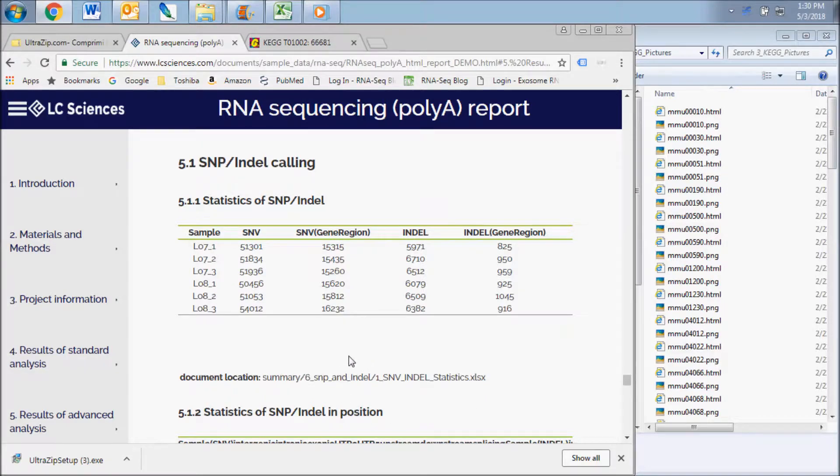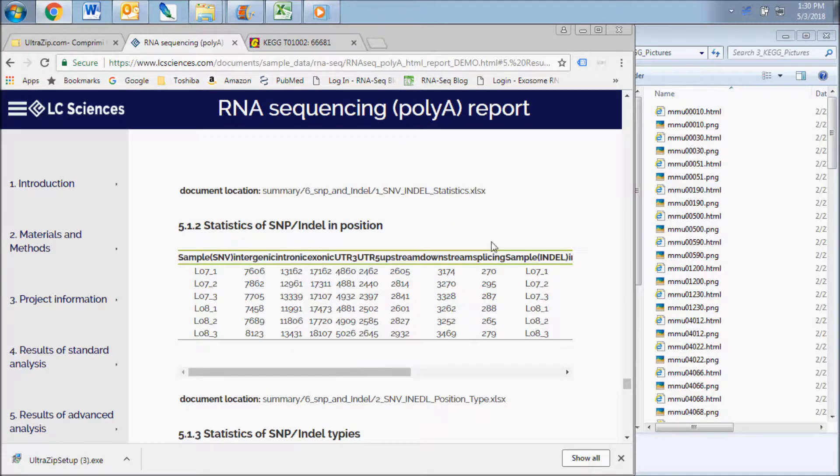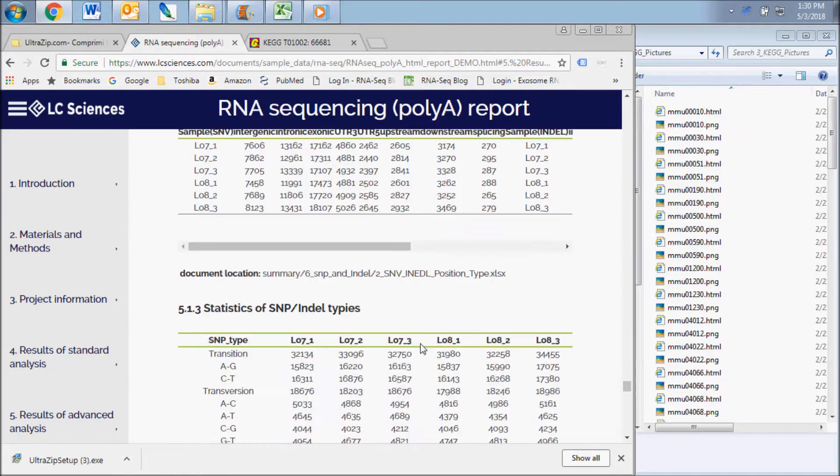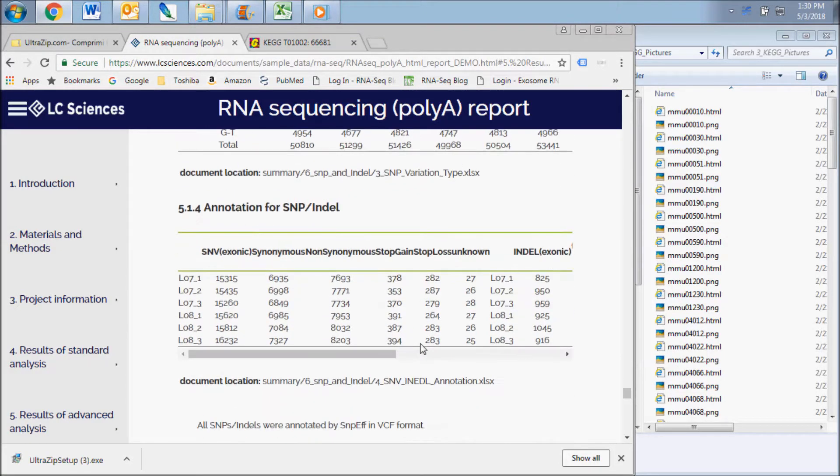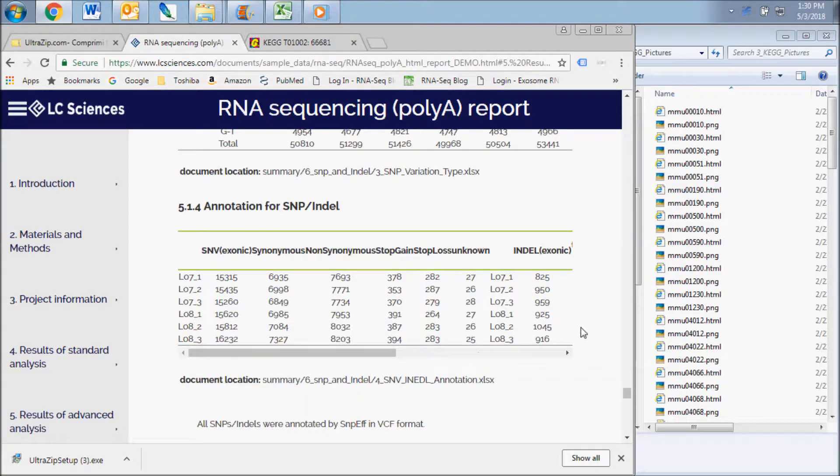This includes the statistical data for the numbers, positions, types, and annotations of the SNPs and indels sequenced in your samples.